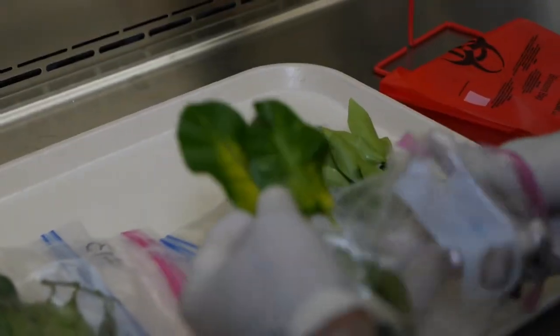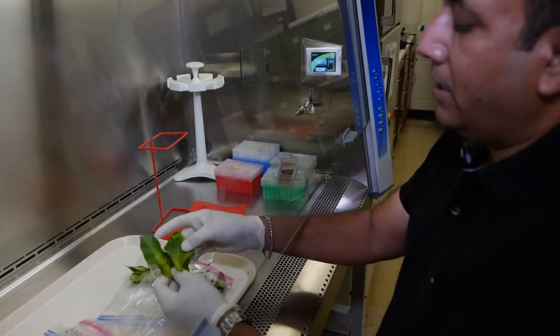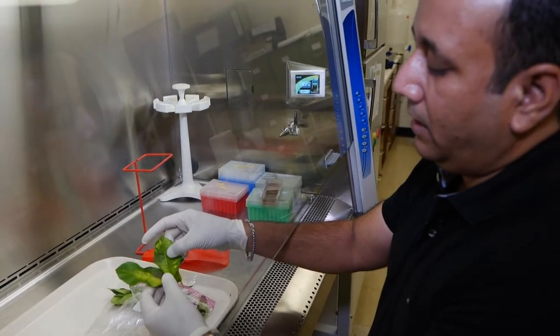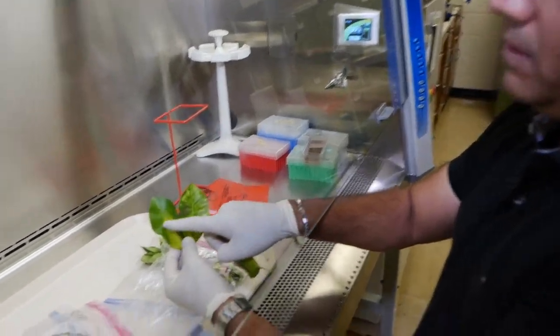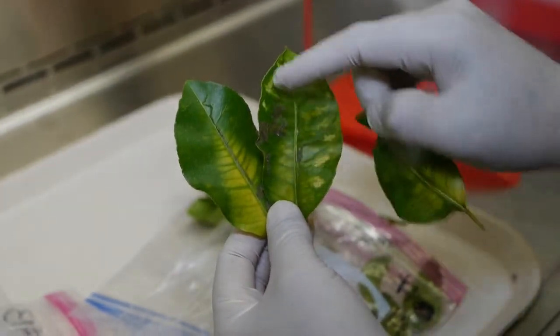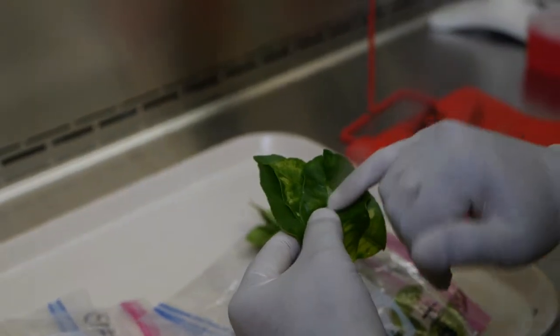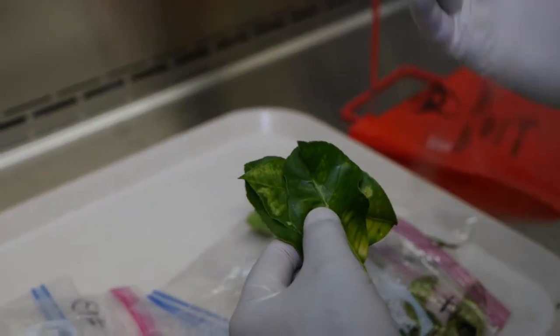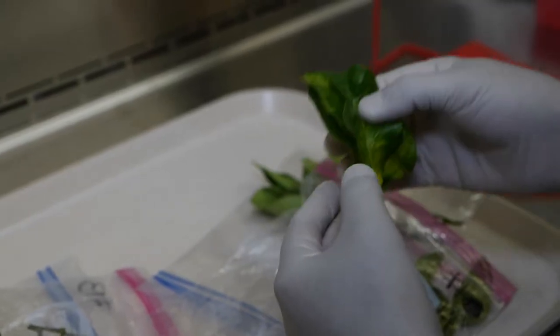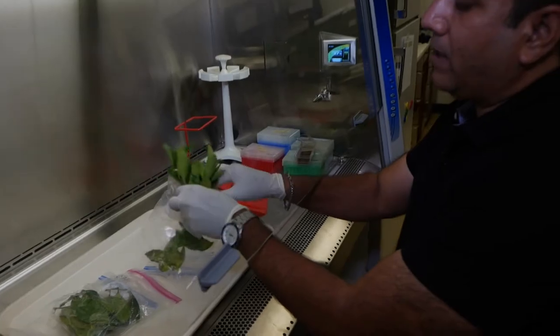But at the same time, this blotchy mottling can easily be caused by a nutrition deficiency. You can see there is some similarity in these two different leaves—similar kind of symptoms—so we definitely need to test it. For this testing, we have to take the midrib samples out. We do the DNA extraction and then run that with specific reagents that will only amplify the citrus greening DNA if it's there.